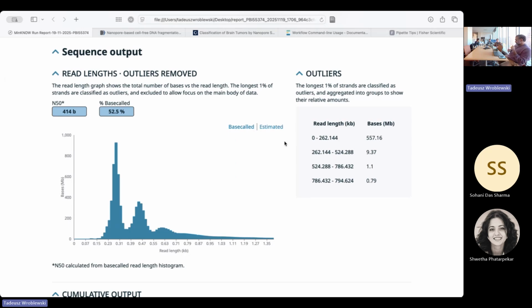Thank you. So clinically too, there would be some benefit if you are using it for diagnostics, depending on how quickly you need it. Yes, that turnaround time. But for our plan analysis, it can happen. For the educational benefit, now turning it on. But our plan, we're not doing diagnostics. Right. So I think we're okay using this data still and moving forward. We can just rebase call it. Thank you for recapping. No, that's a good question actually.